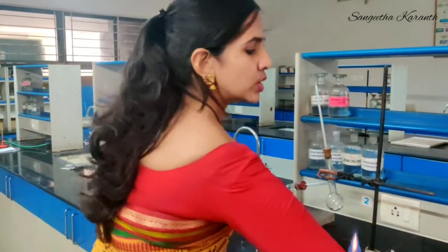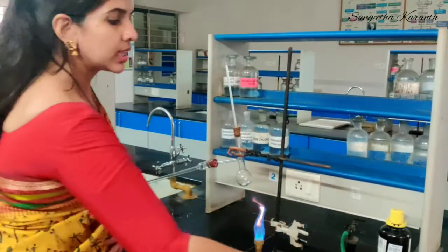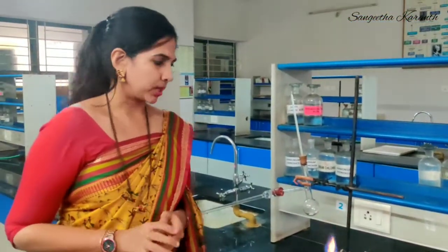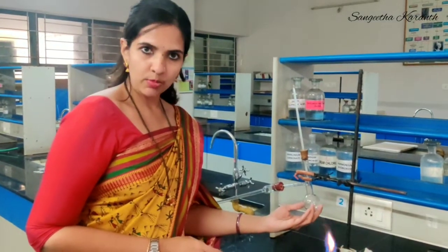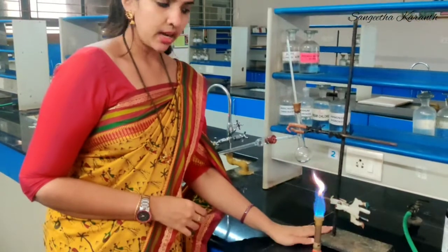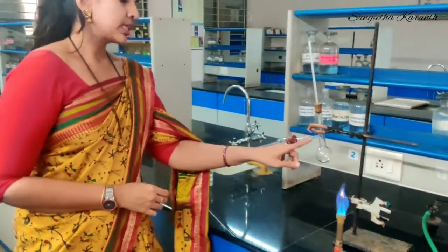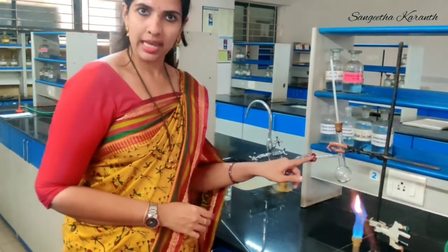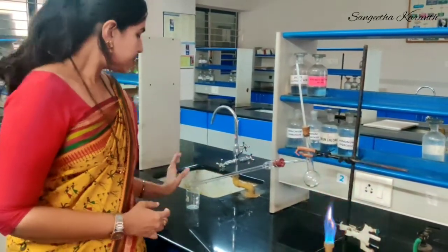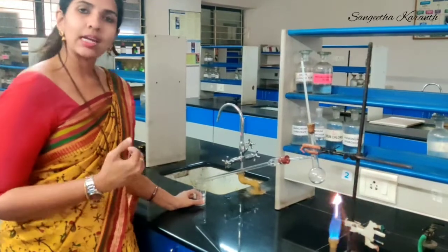Now moving on to the experimental part. First let me tell you the requirements of this experiment. First and foremost we require the unknown organic liquid whose boiling point we have to find out. Then we require this round bottom flask, which is fitted with a thermometer. Then we require the stand and Bunsen burner. The round bottom flask should have a limb which is connected to the condenser. This is the condenser. And then we have the beaker to collect the liquid.